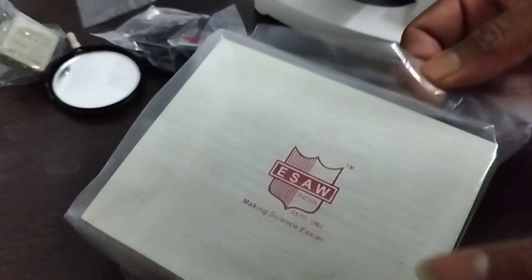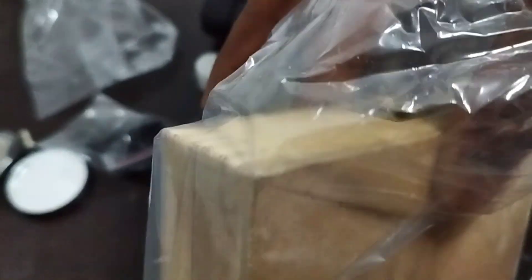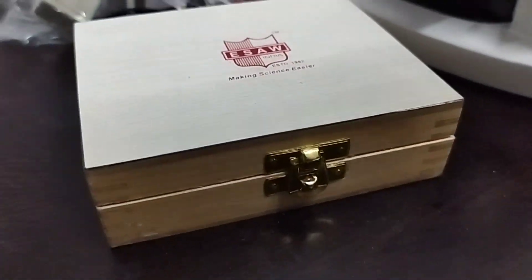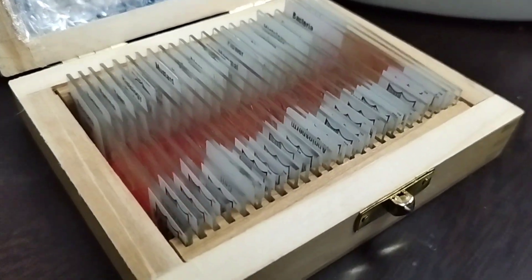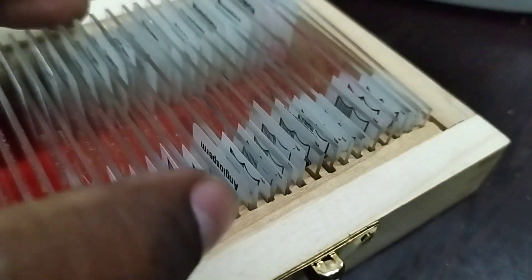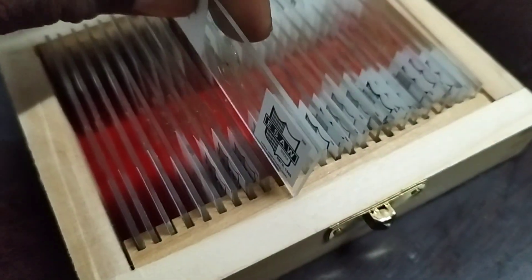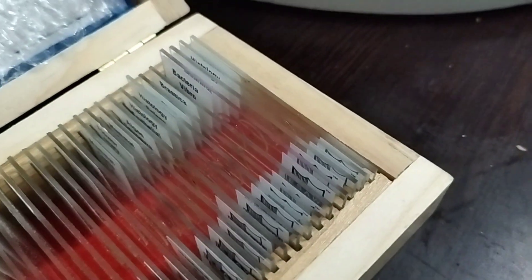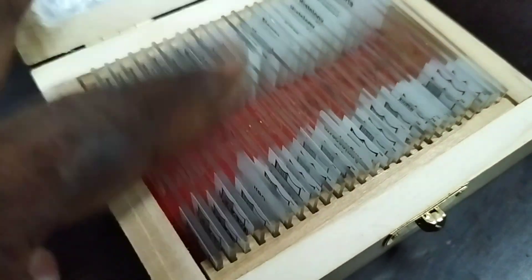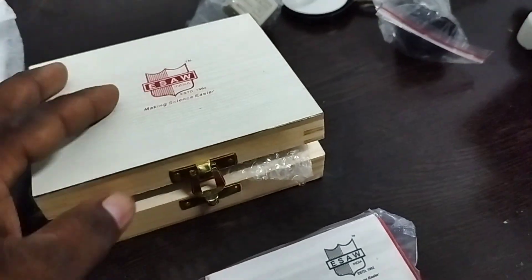I like the box they have provided — it's a fantastic one, like a gift box! There's a lock system on it. Wow, so many permanent slides they have provided! Let's open one — this is fungi, this is tomato leaf. They have provided so many permanent slides and you can write down all the names. Very nice, this is super!